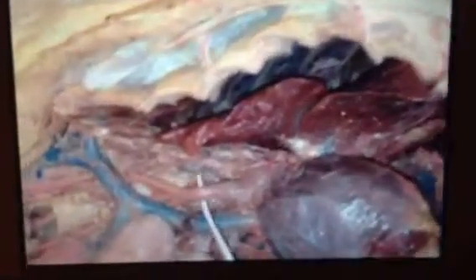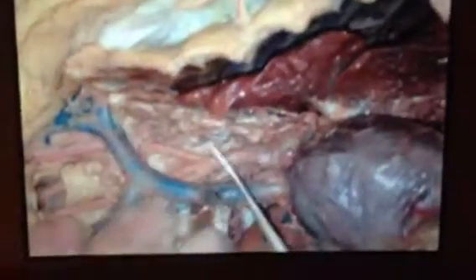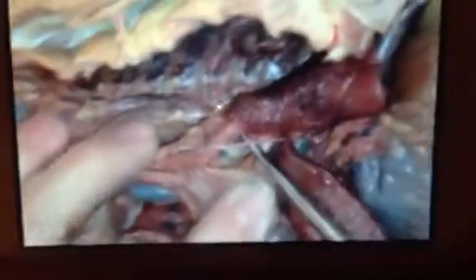Now we have, from the heart, we have brachiocephalic artery, which branches, you guys are making me nervous. Okay, and then back here, this big one is the descending aorta, but in this case it's going to be the thoracic aorta. Thoracic aorta. Right here is the thoracic aorta.